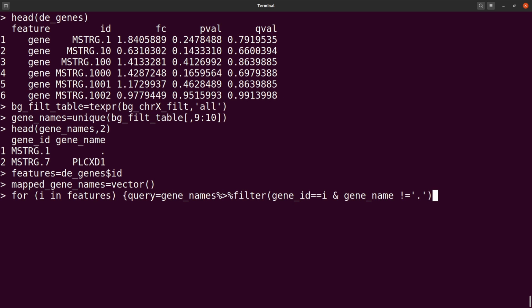After that, we bring this semicolon here. So this is used to separate lines. So that is why I brought it here. So I'll say n hits is equals to then query. And then we want the first value. We issue another semicolon here. And we say if n hits equals 1, that means there was a hit.